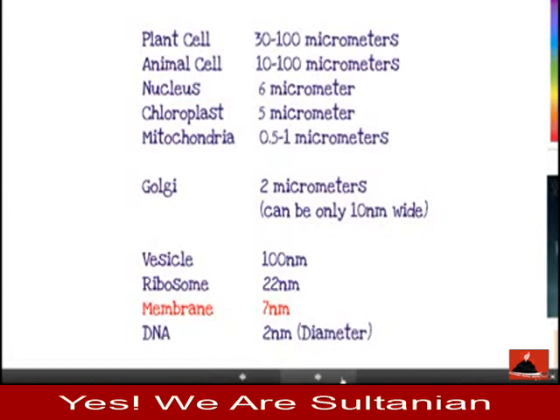So the cutoff is 200 nanometers with regular visible light. Under a light microscope, you cannot physically see anything under 200 nanometers, let alone with the ones that we have in school, like a fairly basic light microscope. So membranes, you're never going to be able to see a membrane. And for some of the organelles, if the interior and the exterior look fairly identical, or there's no difference in density, if you can't see the membrane, then you're not going to see the organelle either.